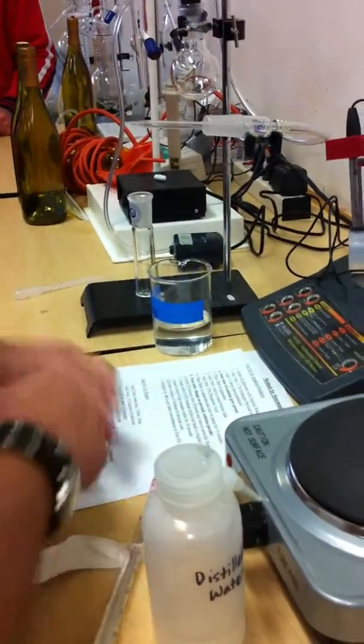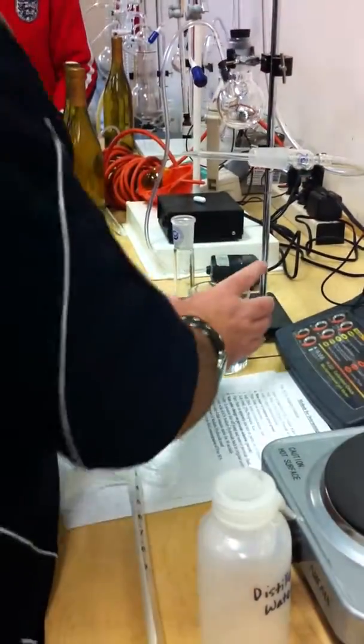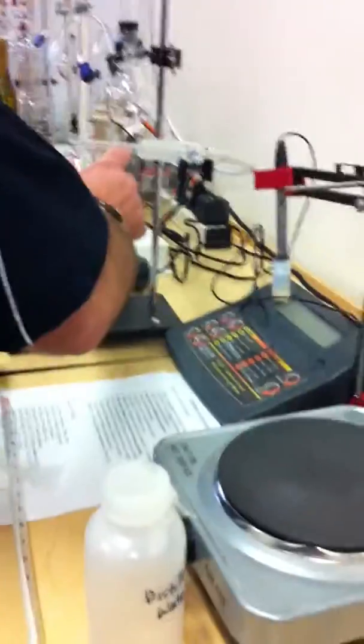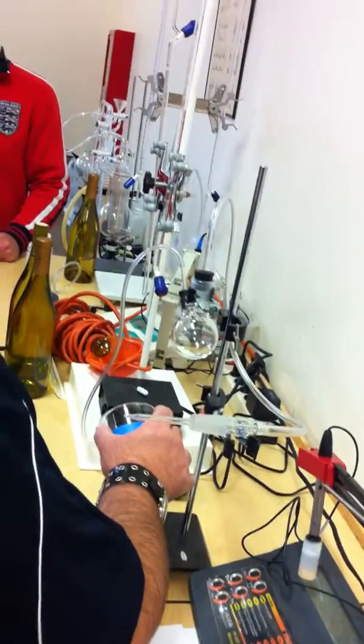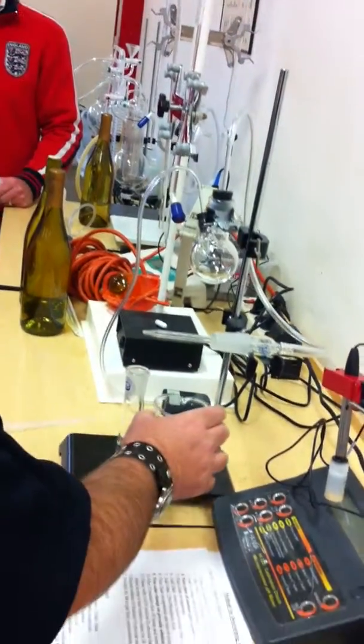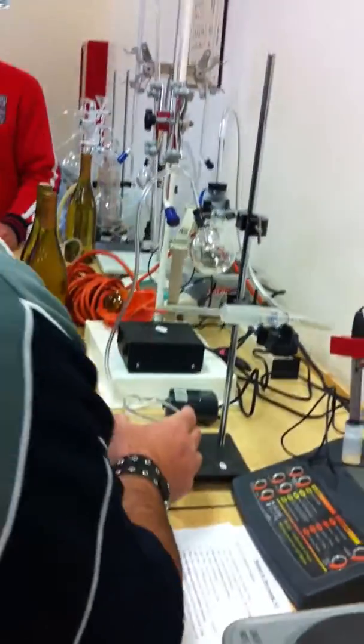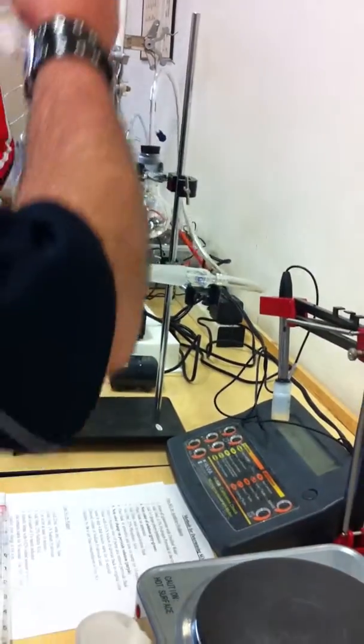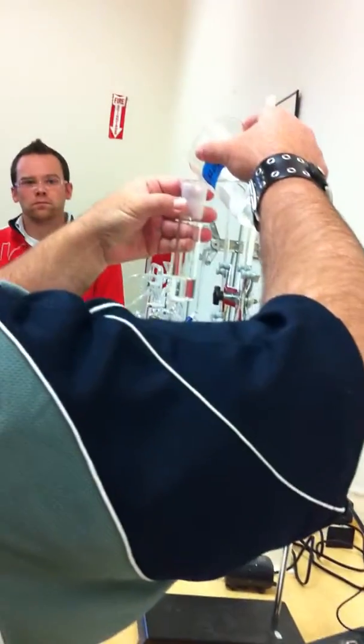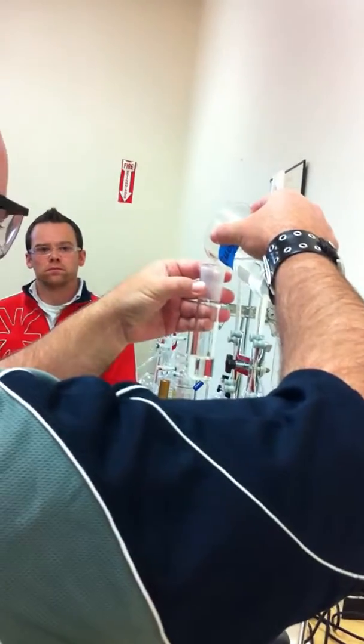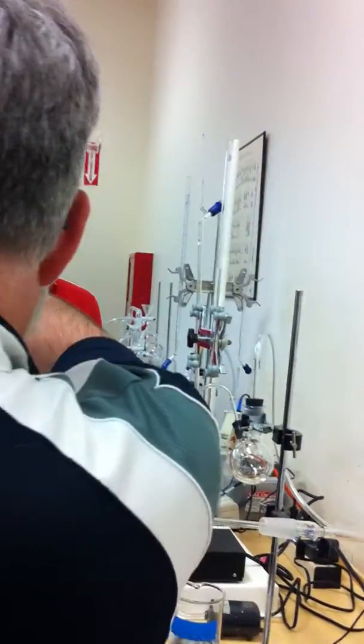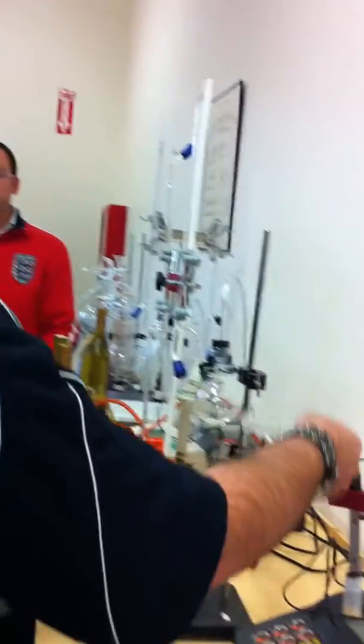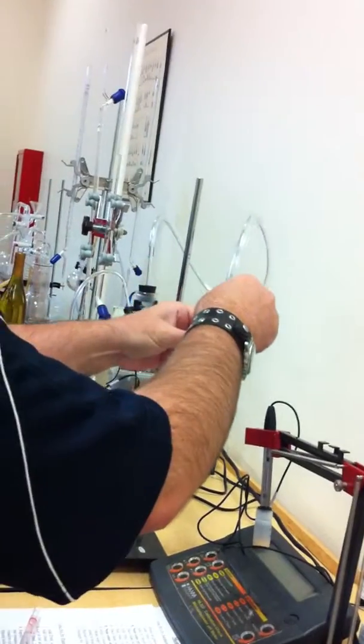You can either use the pipette, you know, 10 mils in, or this line is 10 mils, so you can just pour it in. So that's where you're going to add. I don't want the panel heading to the meniscus.